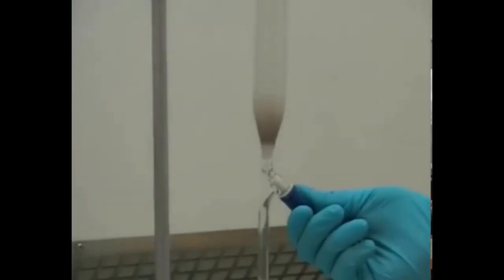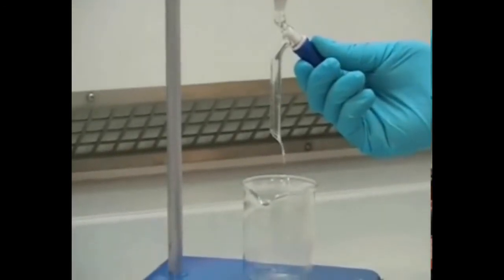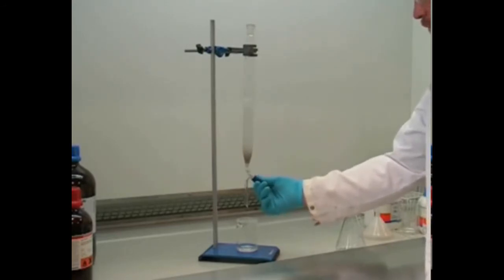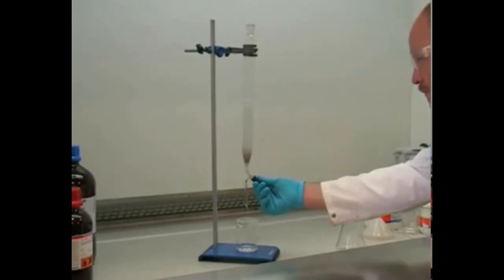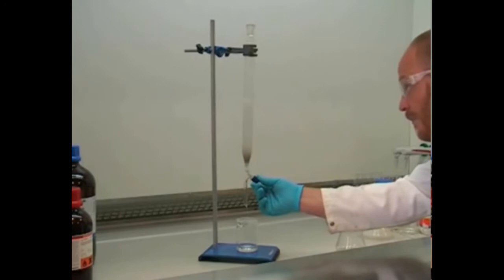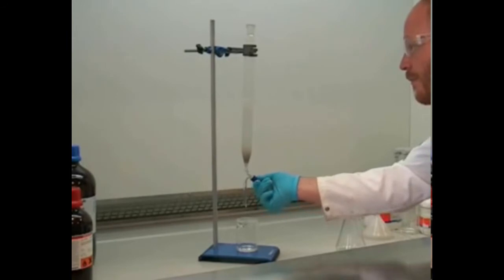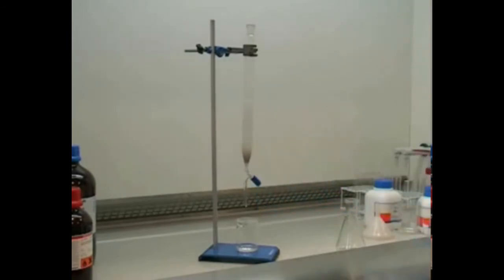Now we need to run some of the eluent out of the column so that it comes down to the level of the silica. It's crucial that you don't allow the silica to run dry, so you need to keep a close eye on the level of the eluent and close the tap at the appropriate moment. Here you can see we've run the eluent down to the correct level so that the top of the silica has not dried out.